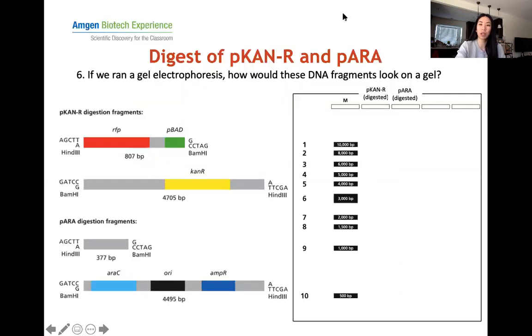So this was 2 groups. I had 2 groups run their DNA on the same gel. So this is one group, this is the other group. Their bands are gonna look different than what you drew here because they ran different samples, but the marker is the same.